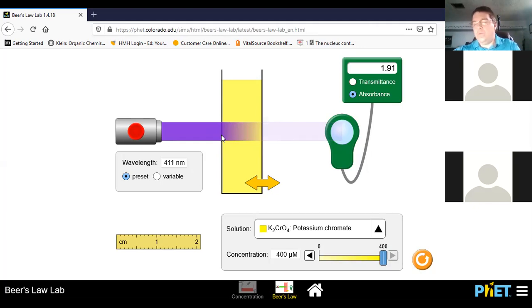And that's what Beer's law, the Beer-Lambert law equation actually helps us to quantify, to be able to calculate what it is. We'll talk more about that tomorrow. But to kind of draw things to a conclusion for today, if you scroll down a little bit, there's an absorbance versus wavelength section on your page here. Some wavelengths of light passing through a colored solution are absorbed more than others.